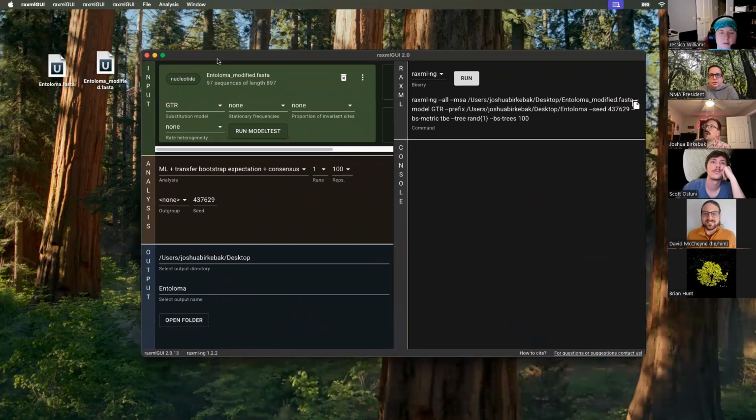There's certain special characters it won't like, it'll just get really mad about. So I normally go through and remove all the characters using Control F, replace in my Google spreadsheet. I replace all the colons with underscores, replace all the spaces with underscores, remove all the quote symbols, remove all the periods, that kind of stuff. But it will at least try to do this.